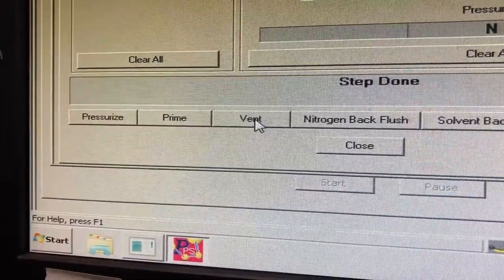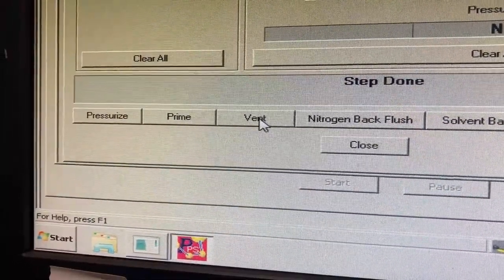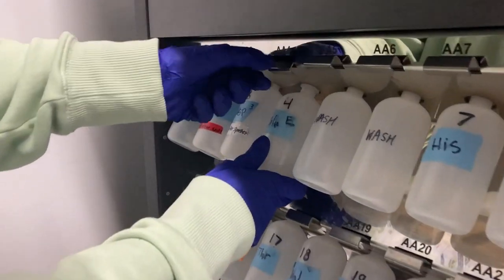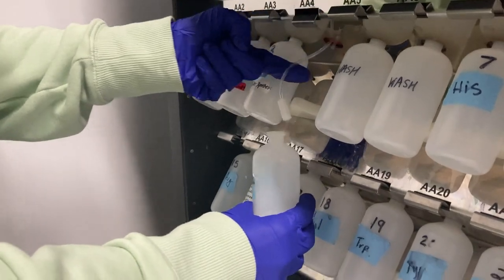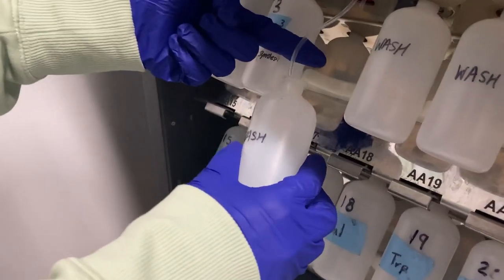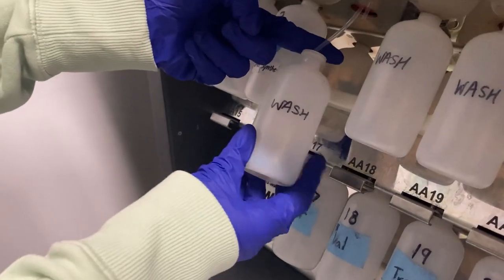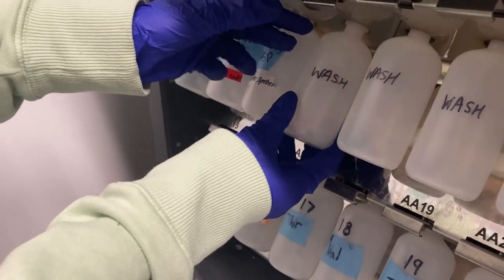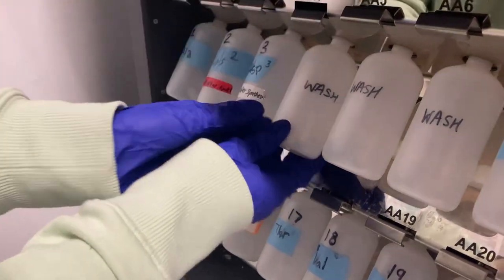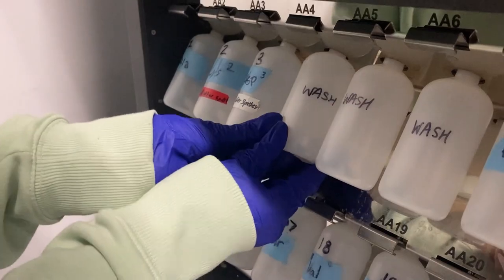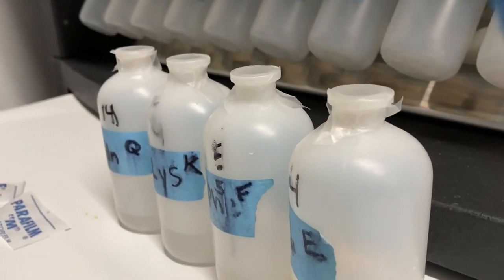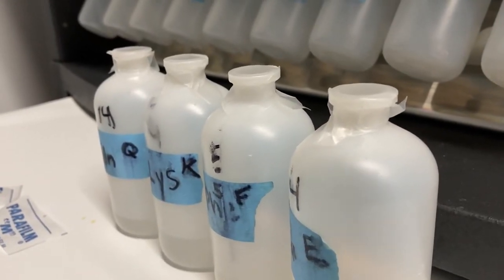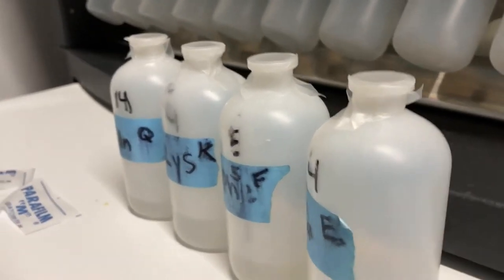Next, vent your amino acids before removing them and replacing them with wash bottles. If there is any remaining amino acid solution, parafilm the bottle and store it in the fridge.